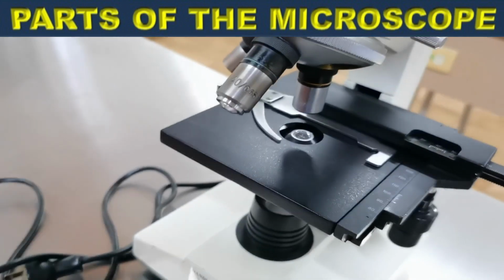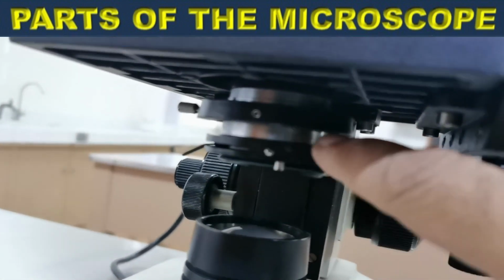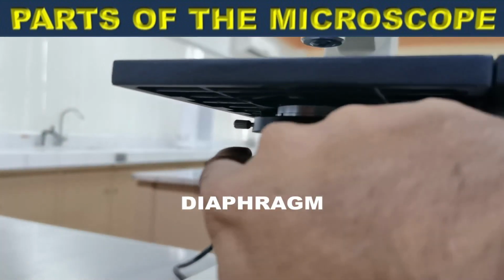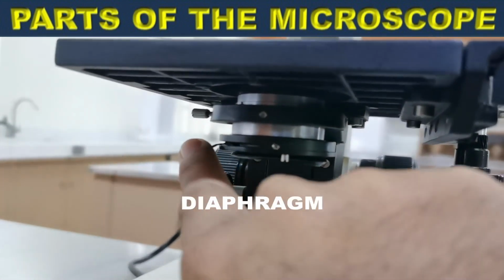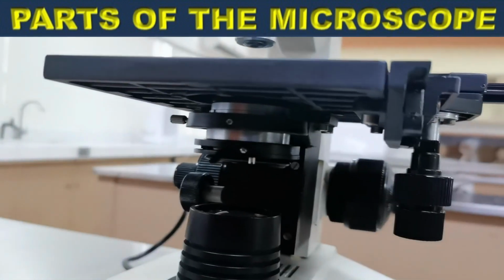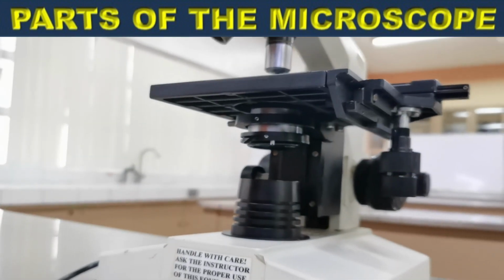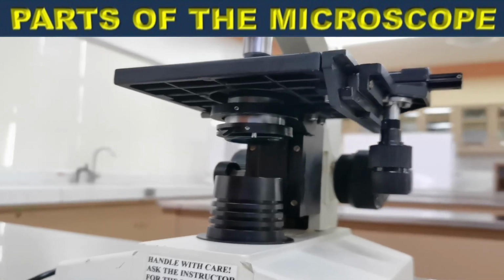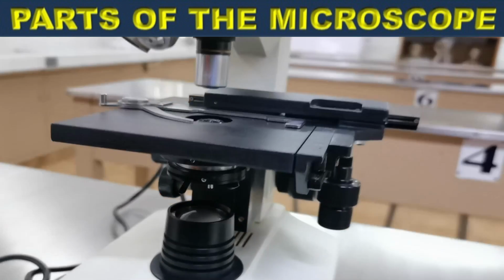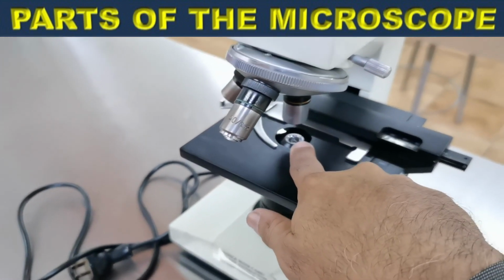In between, let's check this out. There is a component here called the diaphragm. So the diaphragm regulates the amount of incoming light. You can move this so that you can close or open the diaphragm, allowing you to control the amount of light that enters the microscope. So this component right here is called the diaphragm. Then above the diaphragm is the condenser lens right here.